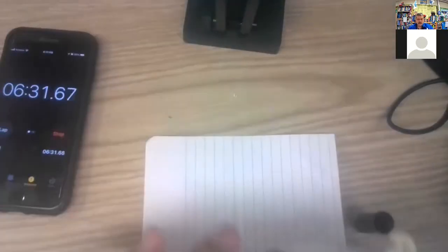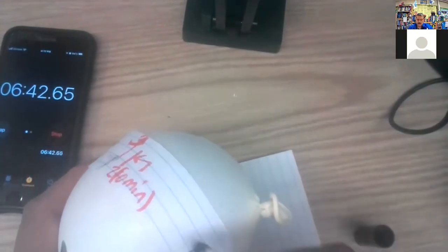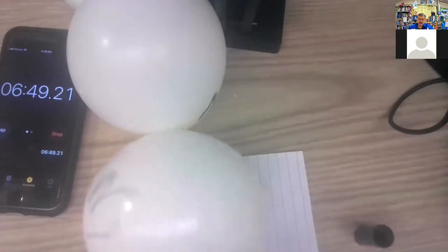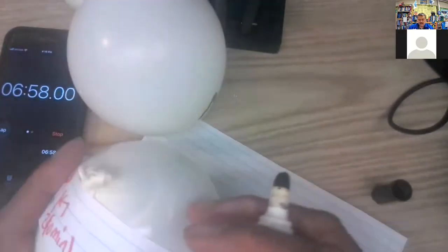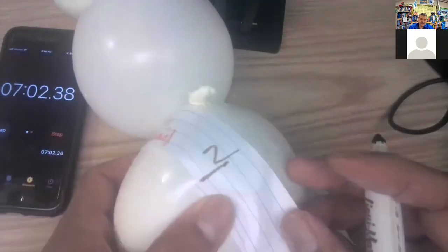Let's take our number 2. 2, I guess, is the biggest measurement that I can get, right there. So that's 2. Three tablets. Remember, I lost that. So I'd like to do number 3 again because it's the same as number 2.